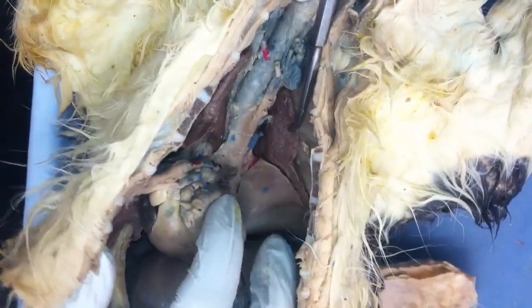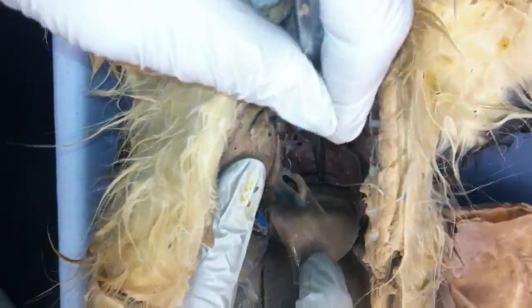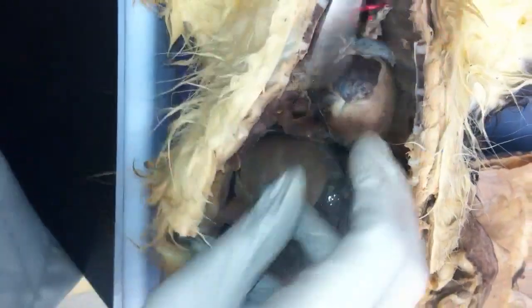And so you've got the left anterior and middle and posterior, right anterior, middle and posterior, and mediastinal lobe.